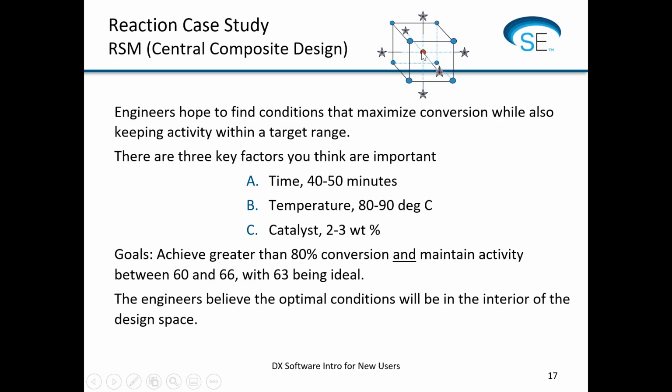So we really want to get a good read on what the center point is. But then we're also going to run these axial star points outside the faces of the cube. And those are going to allow us to fit quadratic terms, those squared terms, effectively. Now, sometimes people ask, do those axial points need to be outside the cube? And the answer is, they don't have to be, but we like them to be because it'll give the best design properties. But if it's impractical to put them there, we give you the option to walk them back to the face or to move them in however you need to.